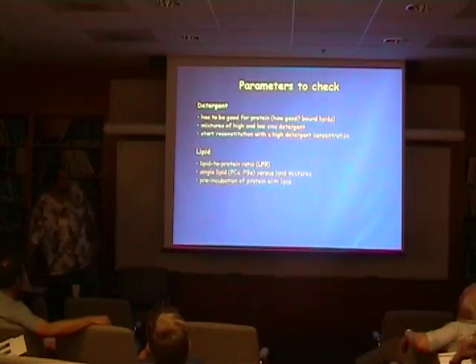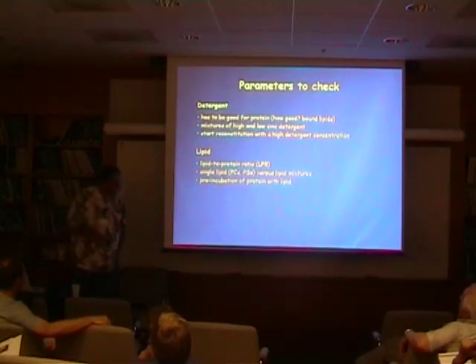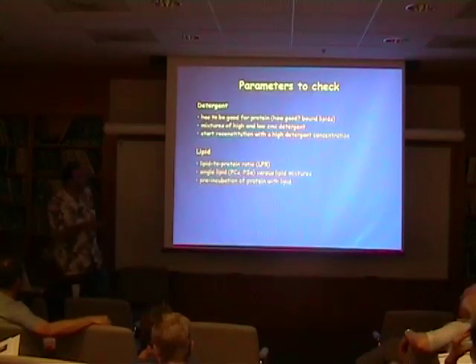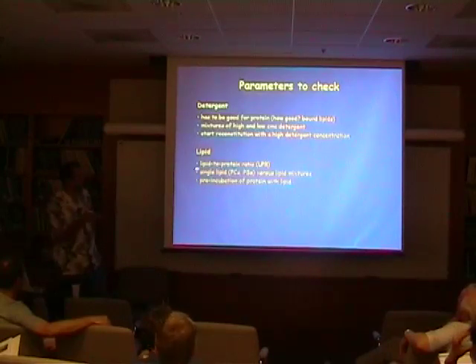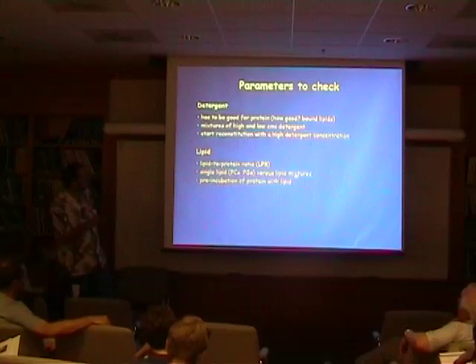And then obviously the lipid is important. So for me, the lipid to protein ratio is probably the most important reason to get really, really high resolution, highly ordered 2D crystals. And the reason why it's so irreproducible, I think, is because simply it's not very easy to determine the protein concentration with high accuracy, and because you have pipetting mistakes, so the lipid to protein ratio is rarely what you actually think it is. And then there's also a discussion whether you want to have single lipid or lipid mixture.